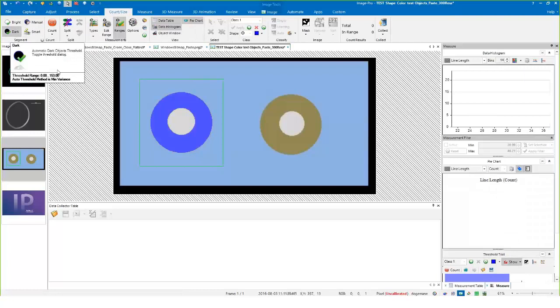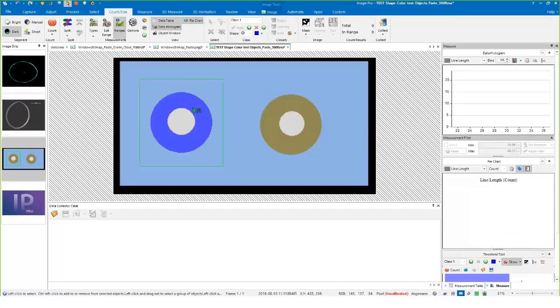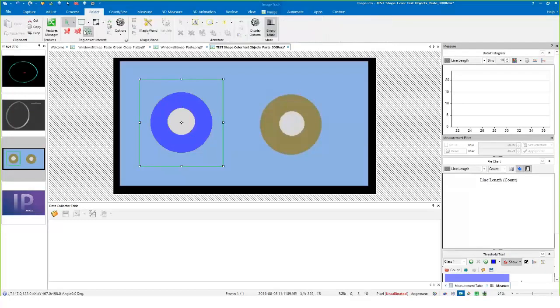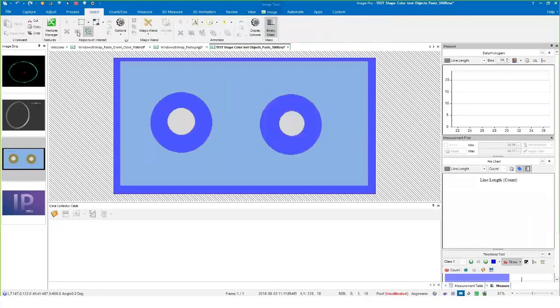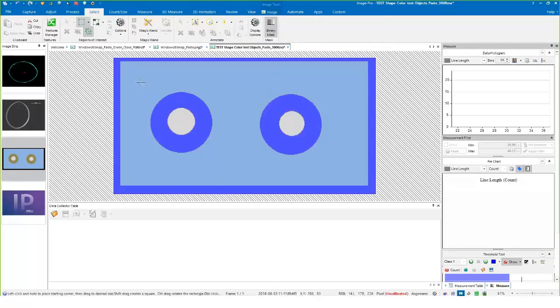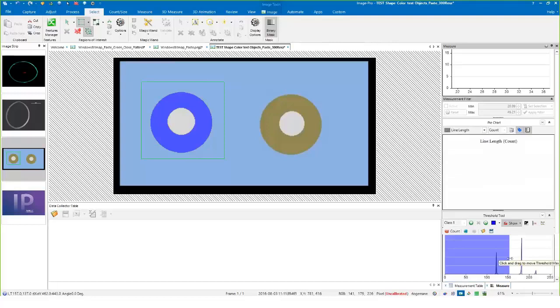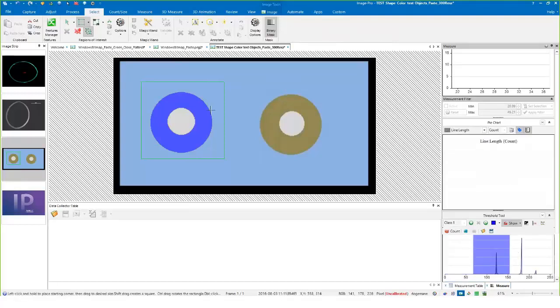If I drew a region around here with this particular sample, I could just use dark segmentation and it nicely identifies the tubing. Next thing we want to do is highlight the actual outlines themselves. With the outline present, I can't get to the object, so I do have to remove the ROI.